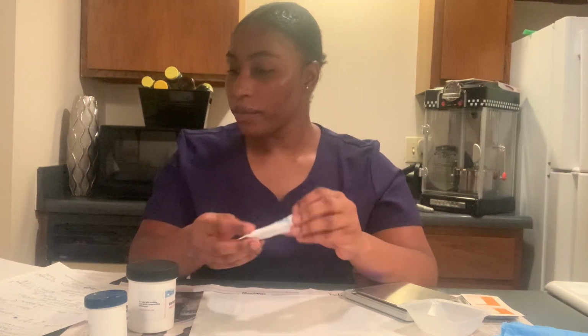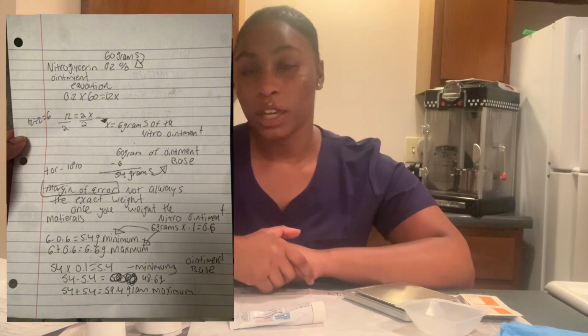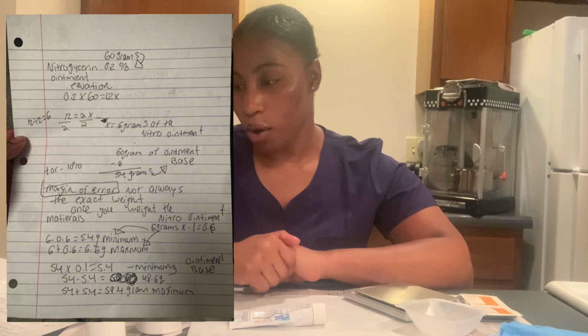thing right here. And how we'll figure that out is we take the 0.2% of the nitroglycerin ointment times the 60 grams of the ointment base, which equals 12.